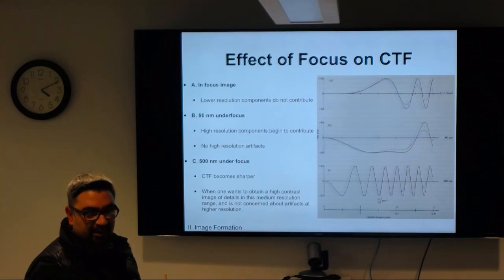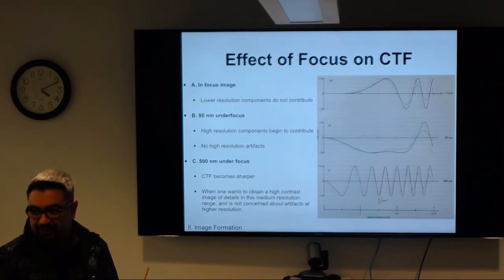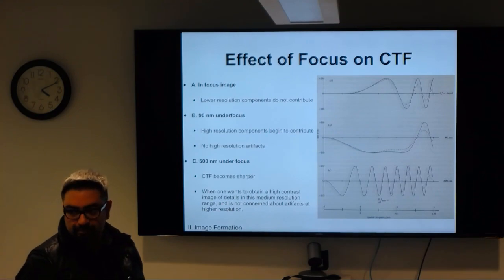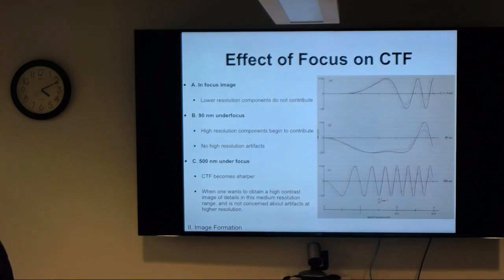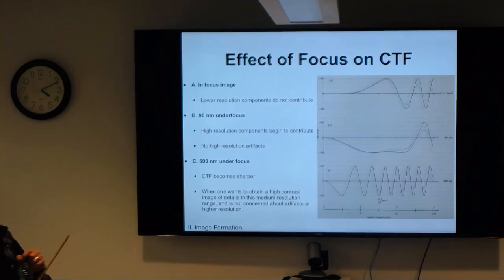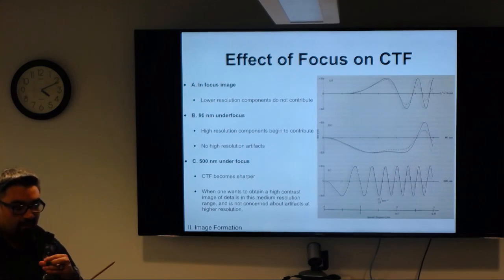For us, let's say we use, I believe, -1 to -2 microns as a good range. And right here, that is like half a micron, so this is not a hugely defocused image. You get a broad coverage of all your spatial frequencies right here.